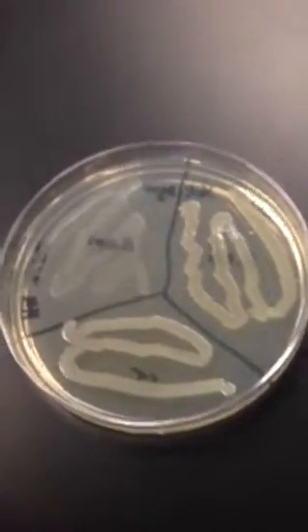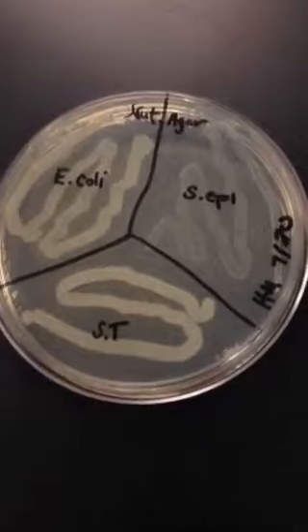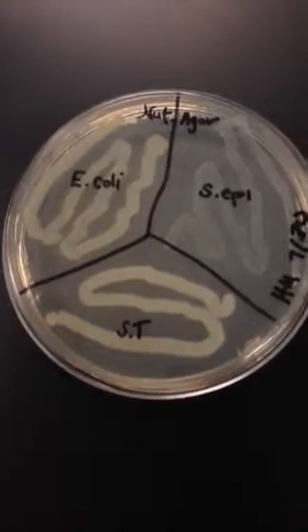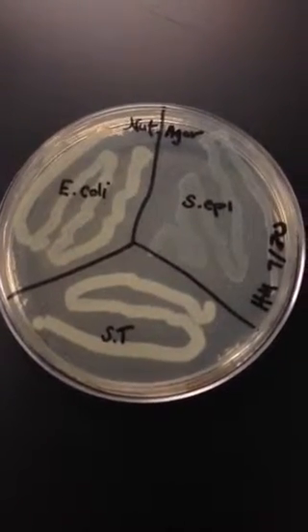If you work with bacteria a lot, you can actually see that three of them are slightly different. I've done this experiment in the past where I used Serratia, which has a red pigment, Micrococcus, which has a yellow pigment, and E. coli, which is white. So you would be able to see the difference easily. Well, for this experiment, it's different. You have unknowns, and they're all Enterobacteriaceae. So they're all going to be similar looking colonial morphologies. Also, in your microscope, the cellular morphology, they're all probably going to be pretty similar.